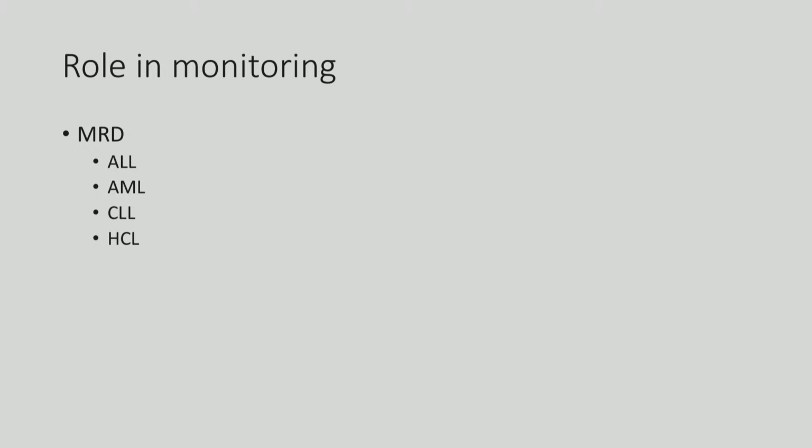MRD is also getting established in monitoring disease response for acute myeloid leukemia. Many centers and central referral laboratories are offering MRD for acute myeloid leukemia. Our center is also going to start monitoring MRD gradually for acute lymphoid leukemia and myeloid leukemia.